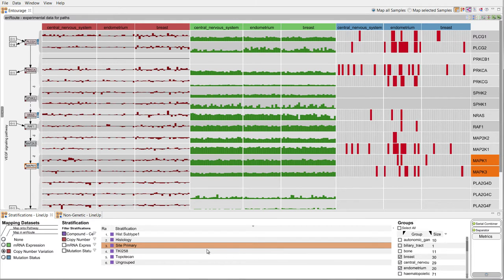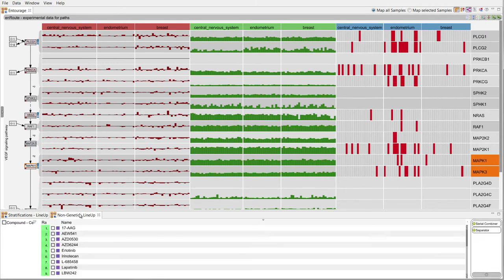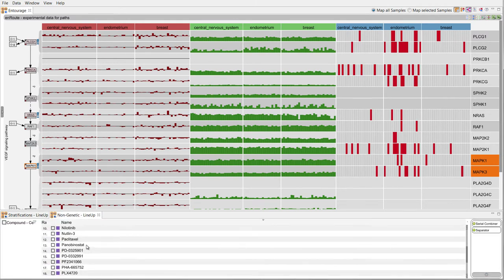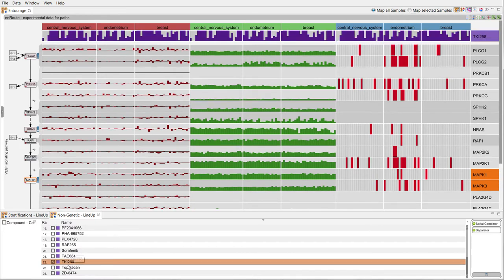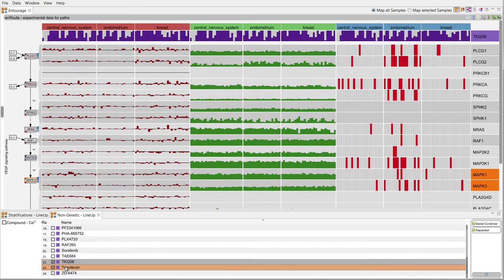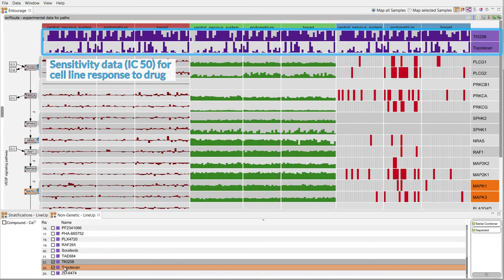We can also add contextual data about the samples, such as clinical variables. In this case, we add pharmacological data that describes the sensitivity of cell lines to a particular drug.